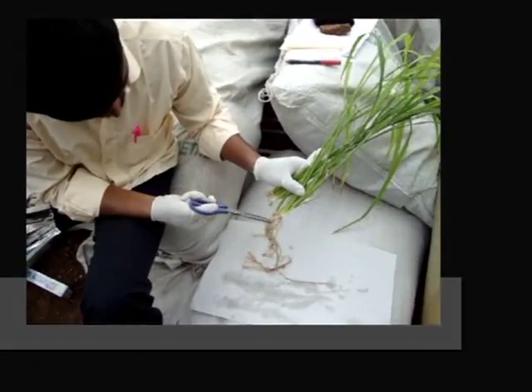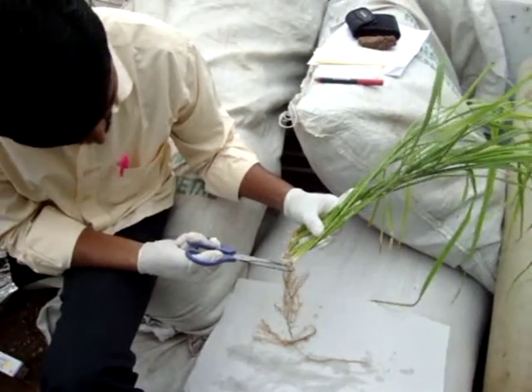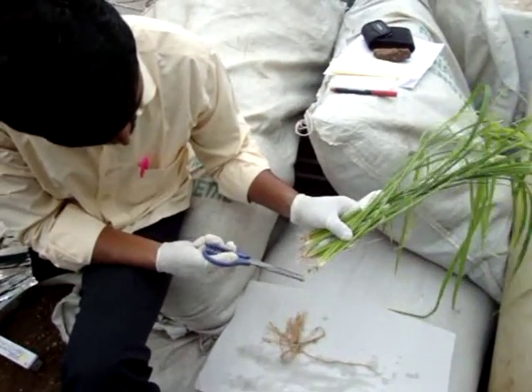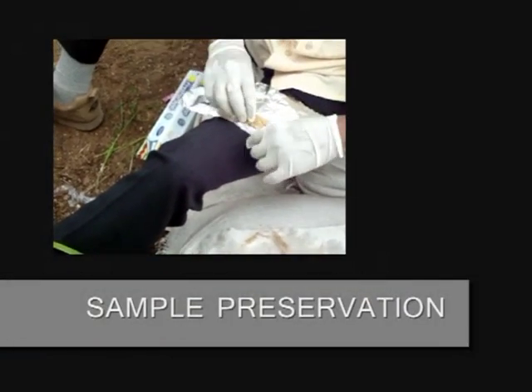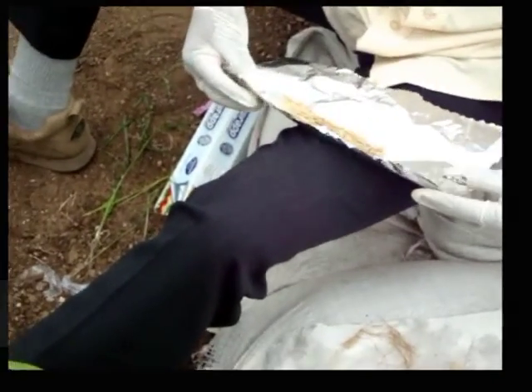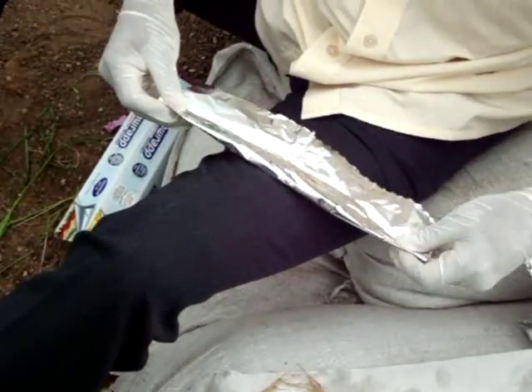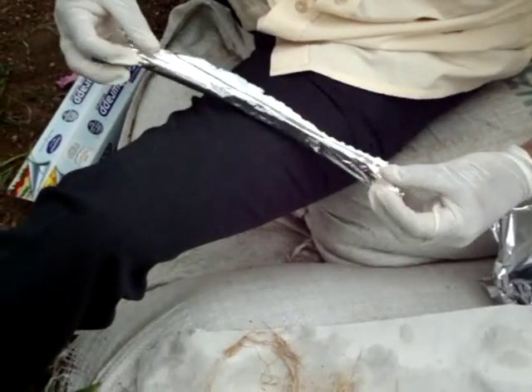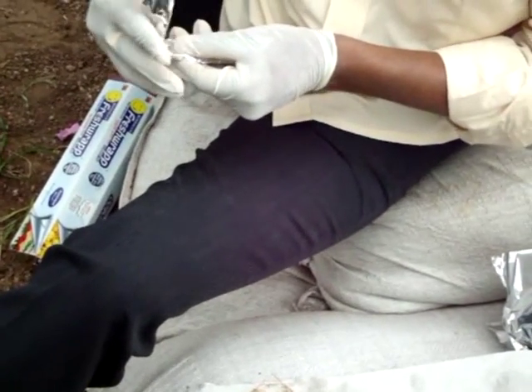Fresh samples were directly harvested into liquid nitrogen and stored at minus 80 degrees Celsius. Fresh samples are highly preferred for high quality results. Utmost care should be given during sample collection, since proteins are highly susceptible to denaturation. The harvested samples were packed in non-reactive aluminium foil.